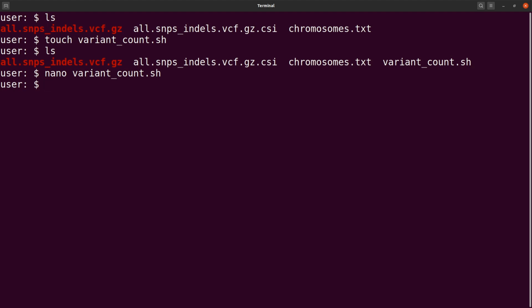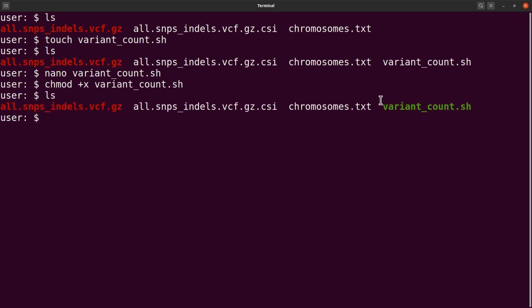Please note that Linux by default does not allow the execution of scripts. So we have to add execution rights. And so we say chmod +x, and then we specify the file, we give the name. And then we run it. When you do an ls, you will find that the color of the file has changed, indicating that it's executable. In some Linux, you have this change of color, but it's fine. Once we have entered this command, we are ready to go.